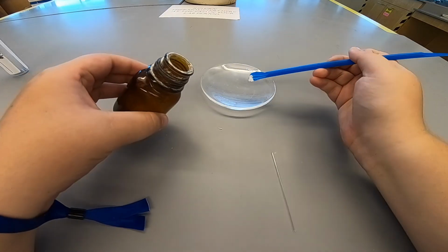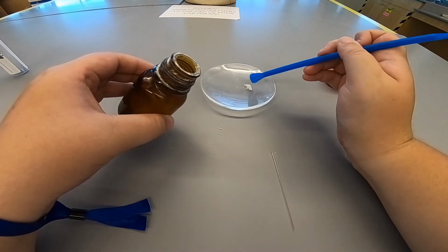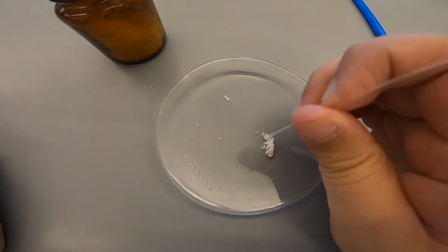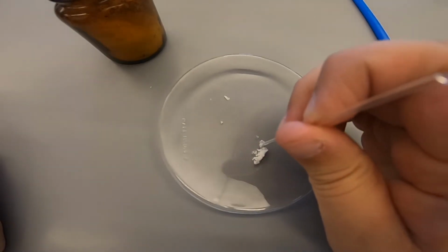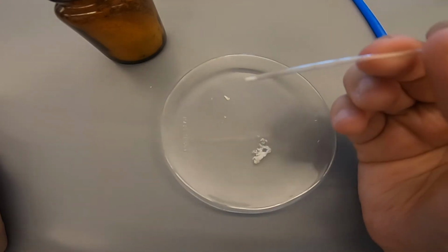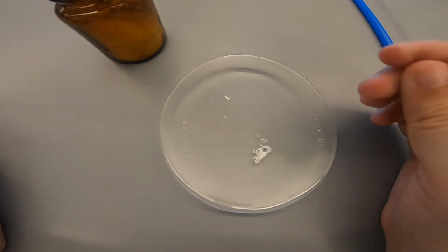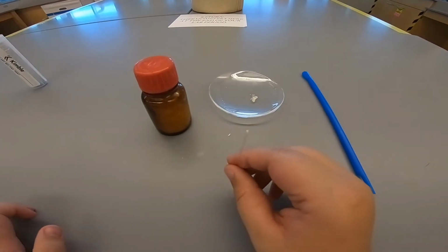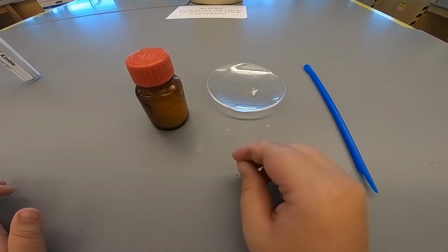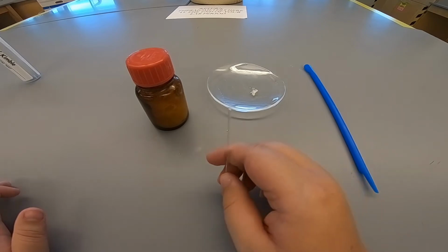To load the solid into the capillary tube, place a small amount of solid onto your watch glass using your spatula. Then thrust the open end of the capillary tube into the middle of the pile of solid. Doing this traps the solid inside the tube. You want about 1 to 2 millimeters of solid. You can then carefully turn over the tube so that the closed end is now down. Tap the counter gently until all solid moves to the closed bottom end of the tube.